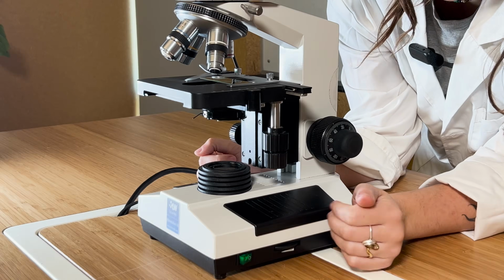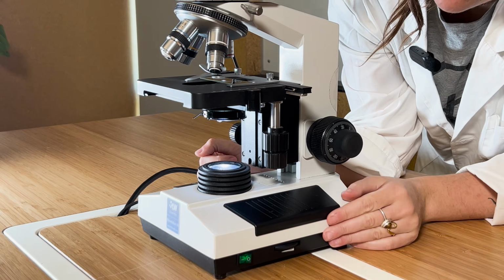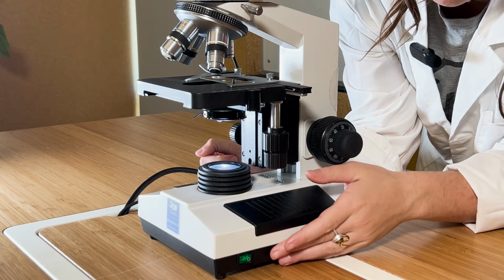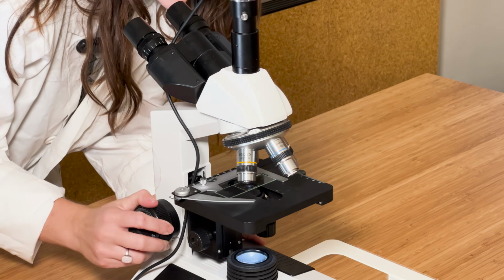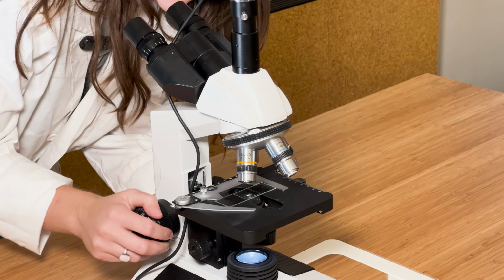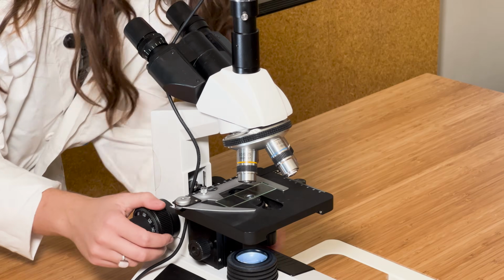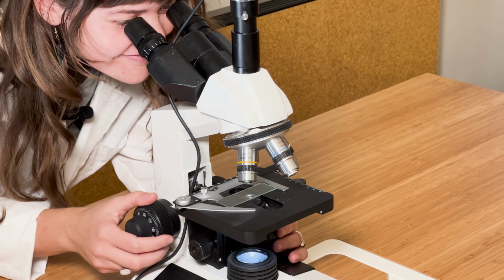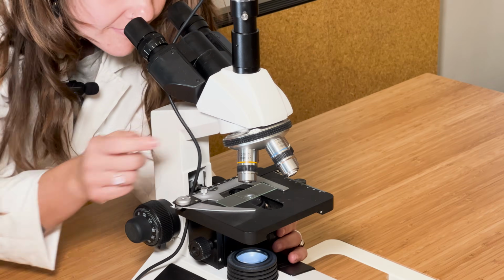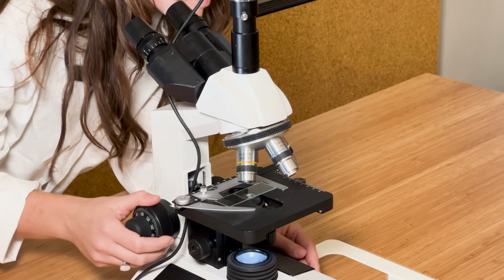Make sure your microscope is plugged in and the light is on. You can adjust how the light hits your sample by using the condenser's adjustment knob. Each time you begin a new microscopy session, it is important to start with your stage fully lowered to avoid crashing into and damaging your objective lenses. For the same reason, always place a sample slide on the stage with the lowest objective, 4x, in place. When you place your sample, you will orient the stage so that the light is shining through the cover slip.